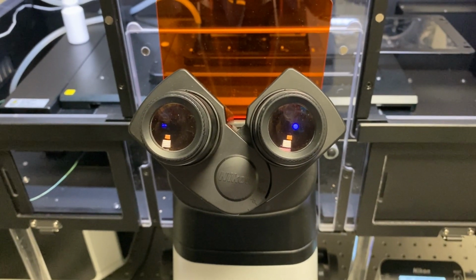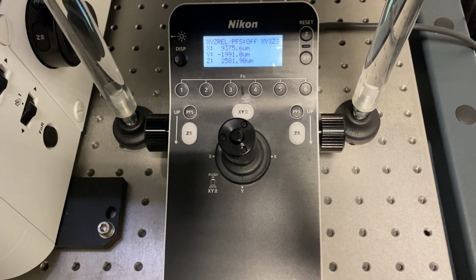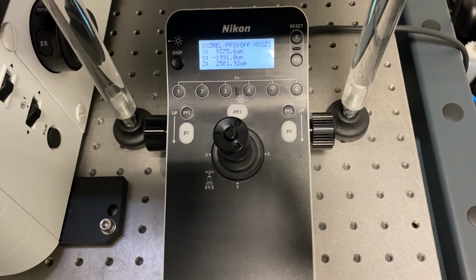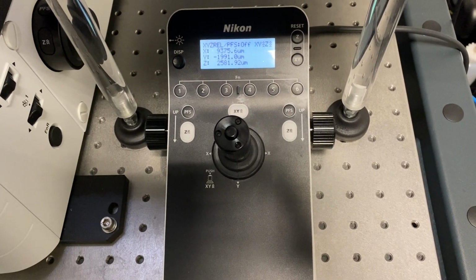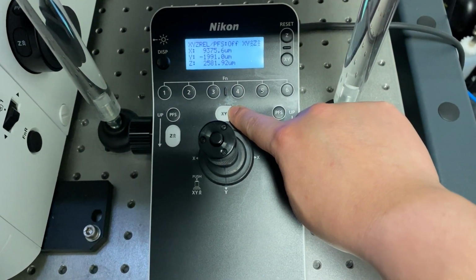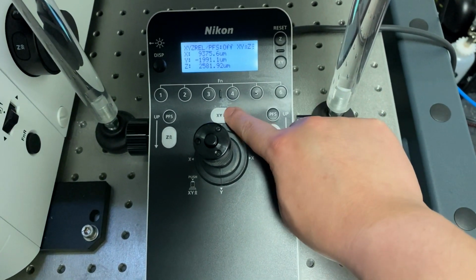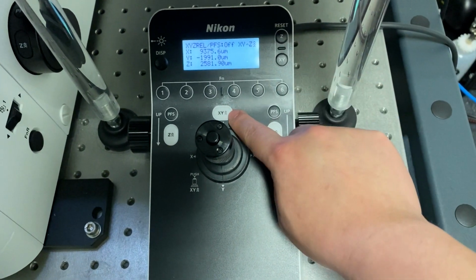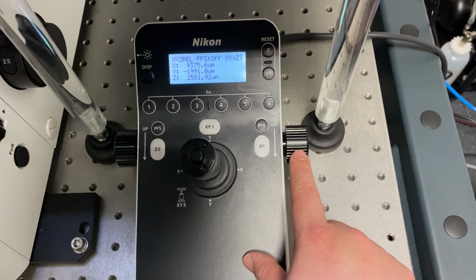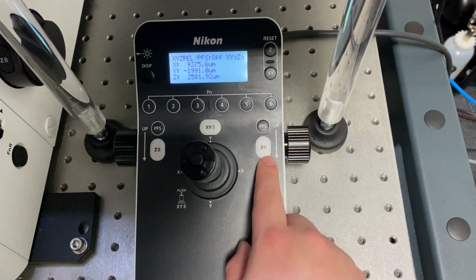Once you are in focus, you want to use the joystick to move around and look for other parts of your sample. But before you do so, please slow everything down because we are now very close with our lens to our sample. So use this button to slow down XY movement. You can see 2 arrows means slow, 1 arrow means extra slow. We usually use 2. Same as the wheel, so this button will slow down any wheel movement.